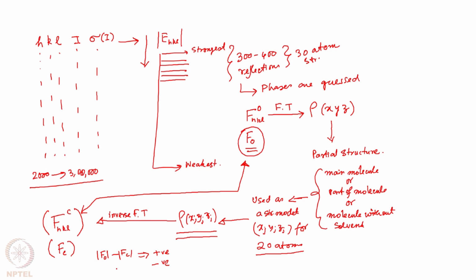There must be something still to be assigned so that the structure factor amplitude should match the observed value, which generally never matches 100%, but this difference can be minimized. When it is negative, that means whatever atom we have placed there is incorrect. It probably has fewer electrons, or its occupancy is less, which increases the calculated structure factor compared to the observed structure factor. So these observations are then made during the structure refinement process.